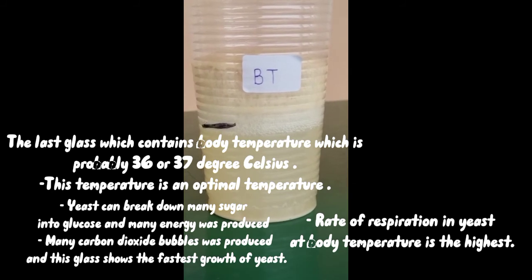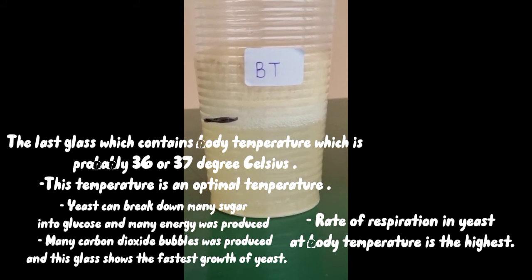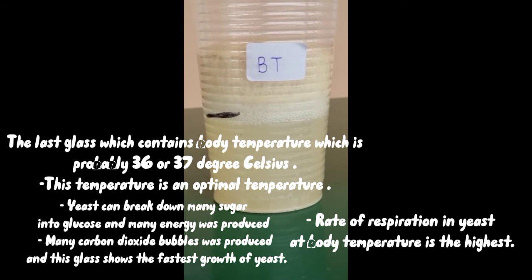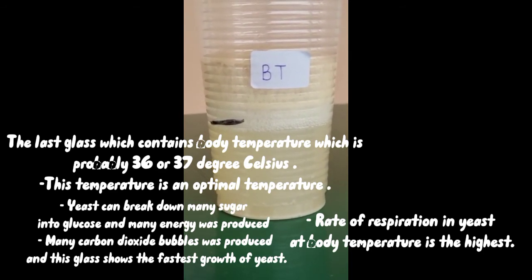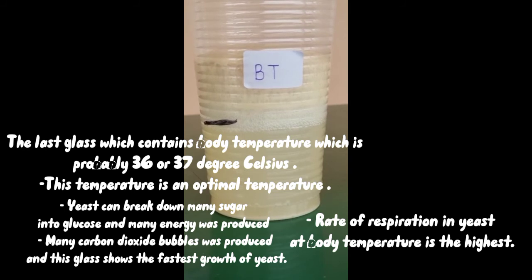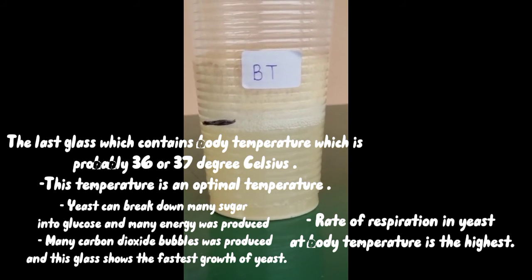The last glass contains water at body temperature, which is probably 36 or 37 degrees Celsius. This temperature is an optimal temperature. Yeast can break down much sugar into glucose and much energy is produced. Many carbon dioxide bubbles were produced, and this glass shows the fastest growth of yeast. The rate of respiration in yeast at body temperature is the highest.